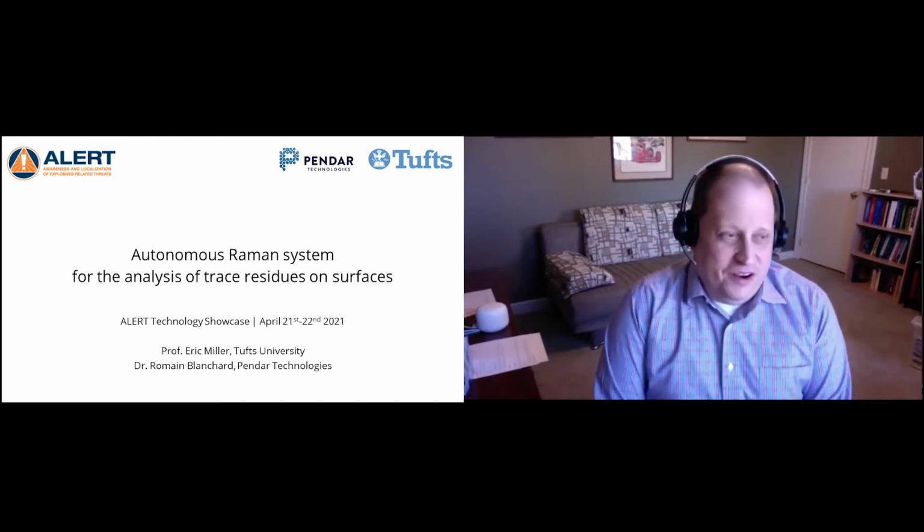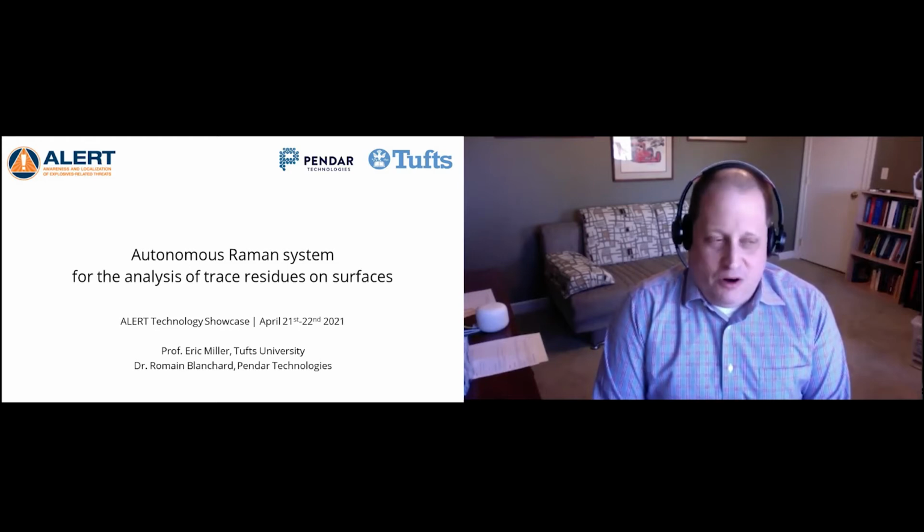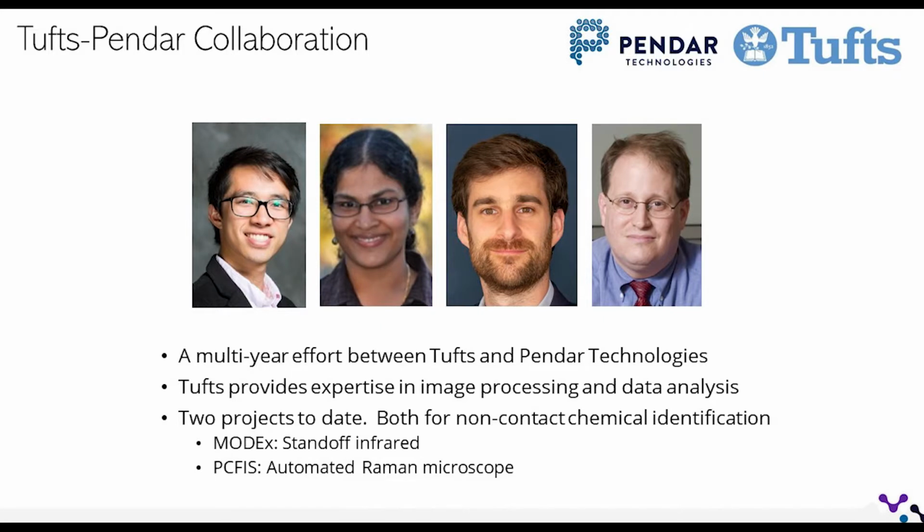This is one of a number of successful collaborations between academic partners at ALERT and industry partners at ALERT. In particular, the Tufts Pendar collaboration has been active for 4 or 5 years now. The folks at Pendar have amazing expertise in the development and deployment of a variety of microscopy and optical systems. Tufts has been able to help a little bit on the algorithms and image analysis side. There have been 2 projects that we've engaged in. The first was the standoff infrared system under the MODEX program run by the Homeland Security Department.